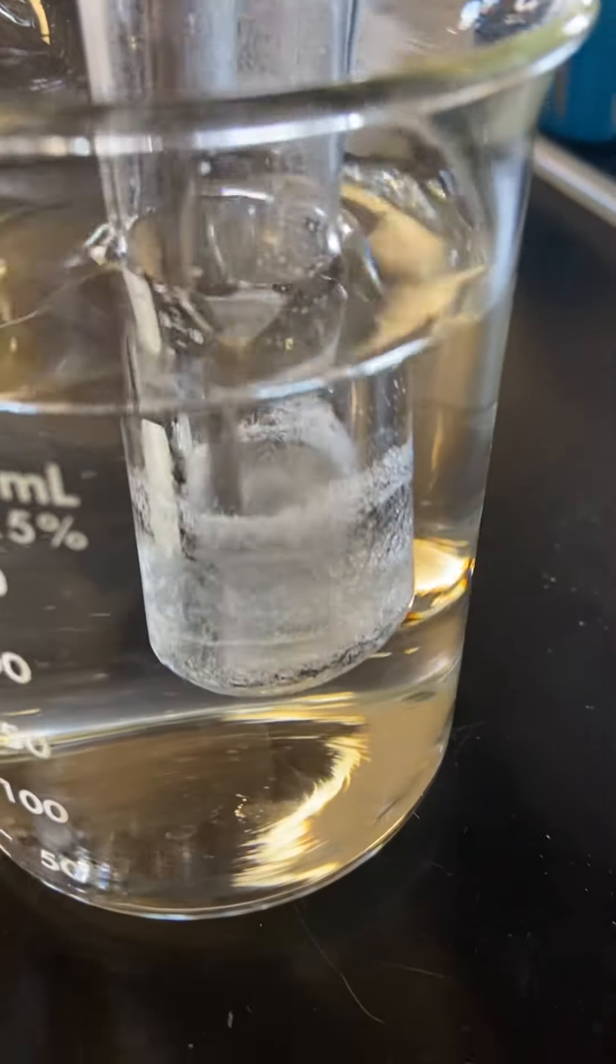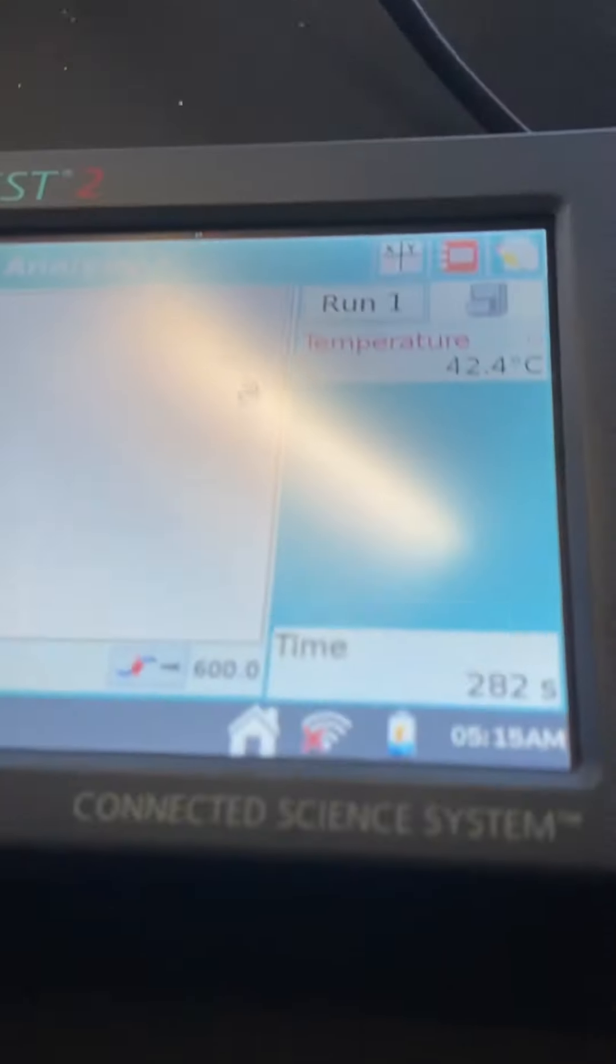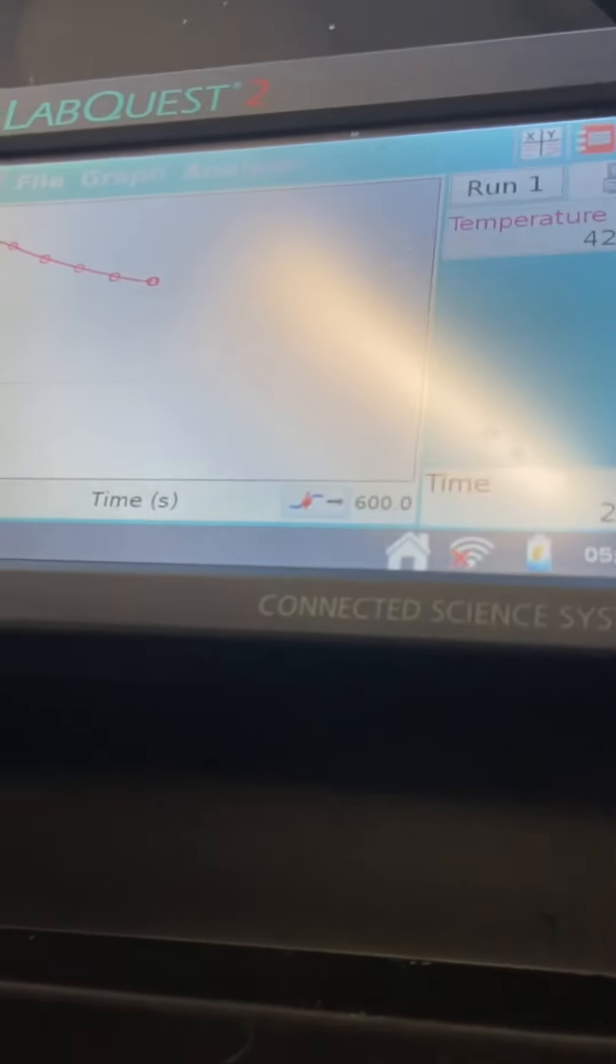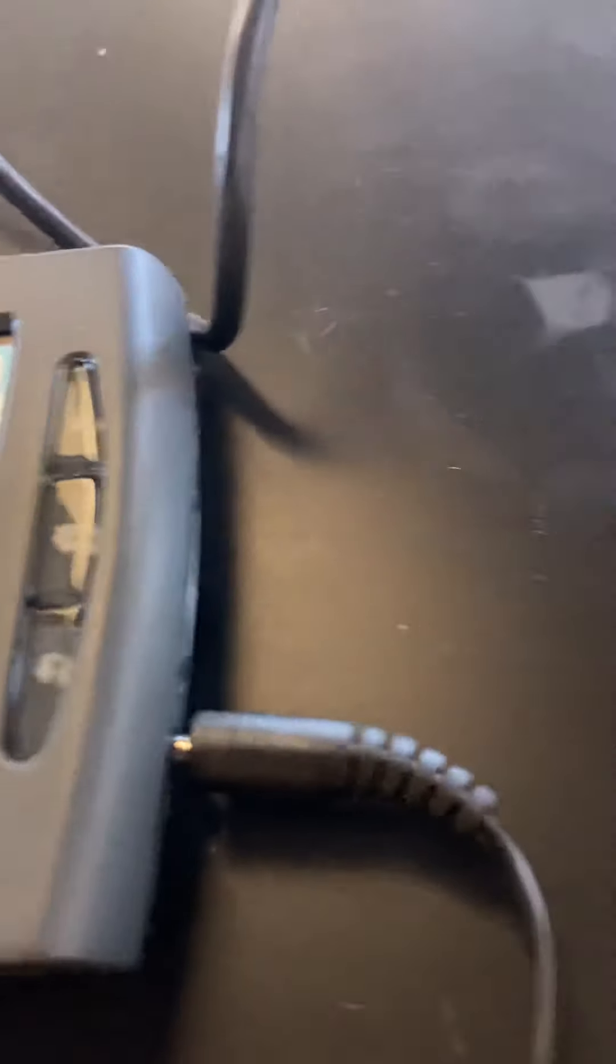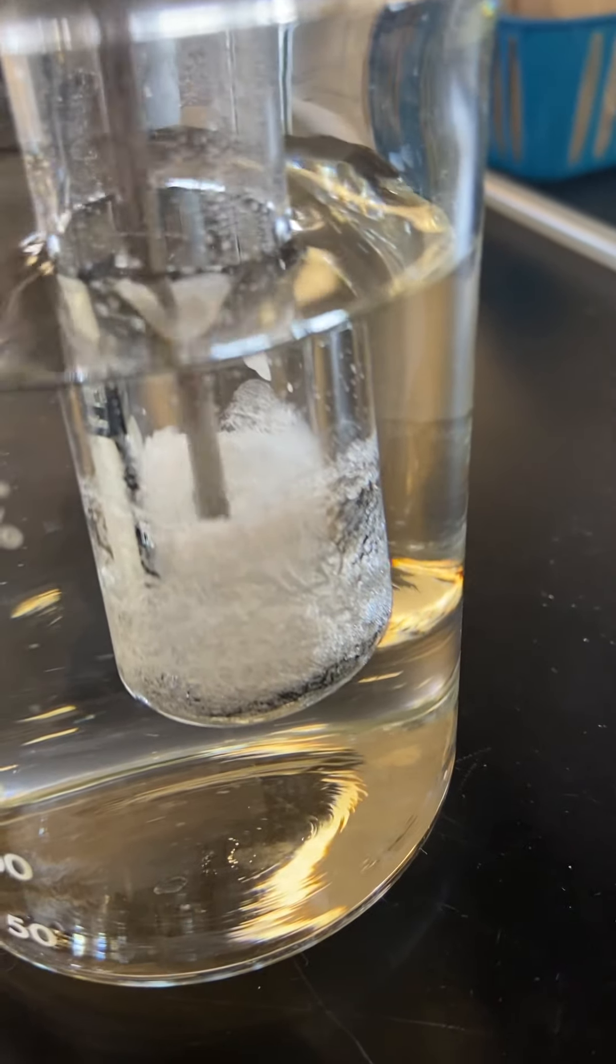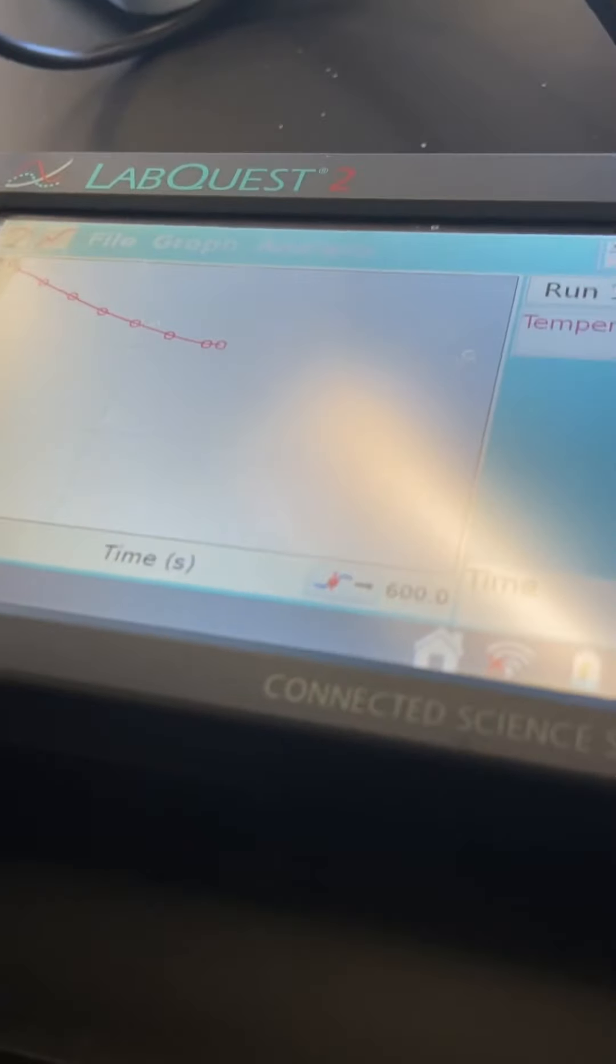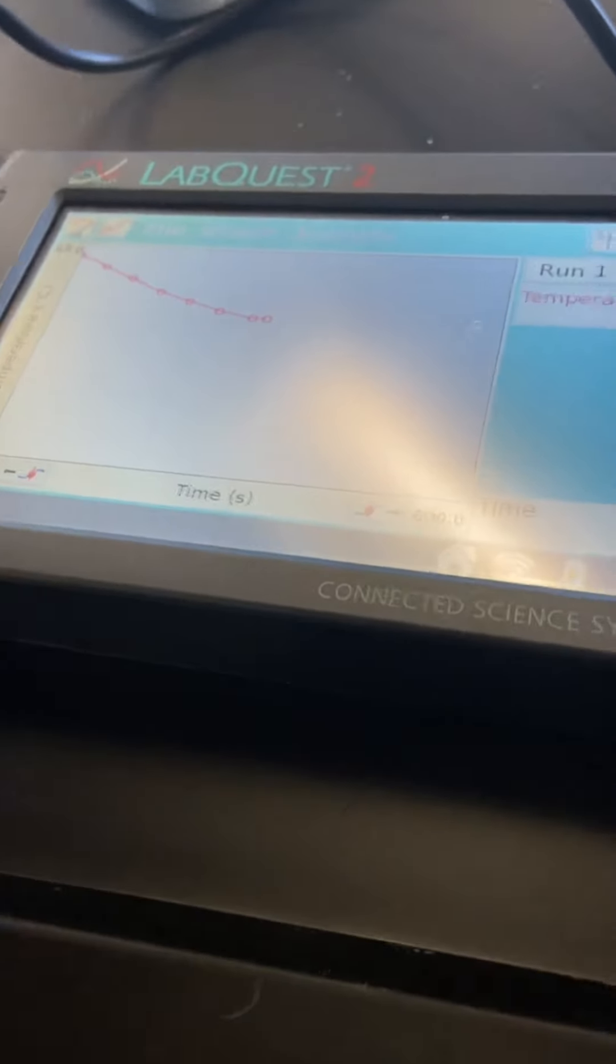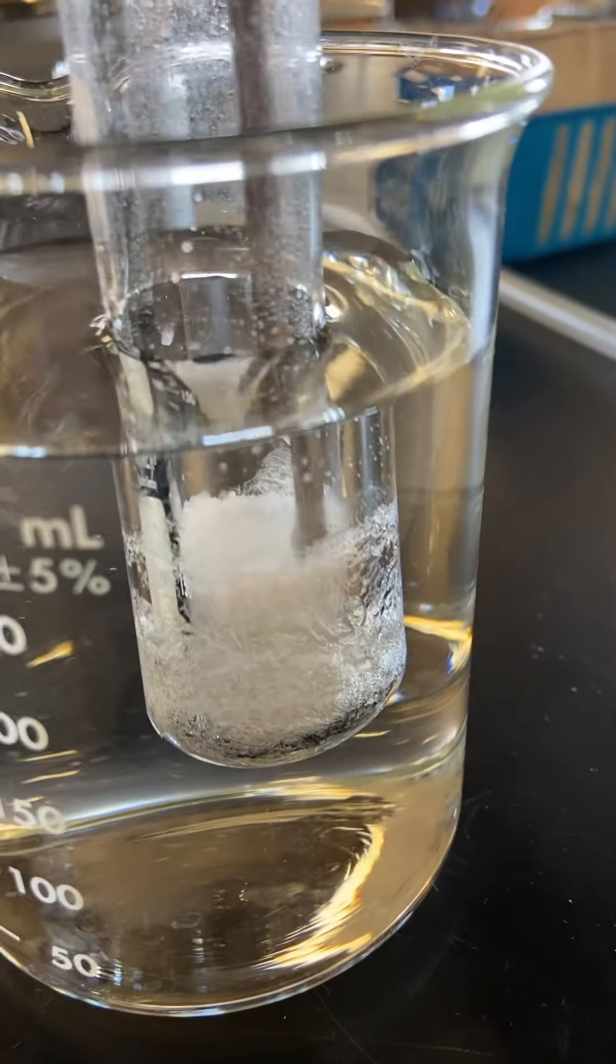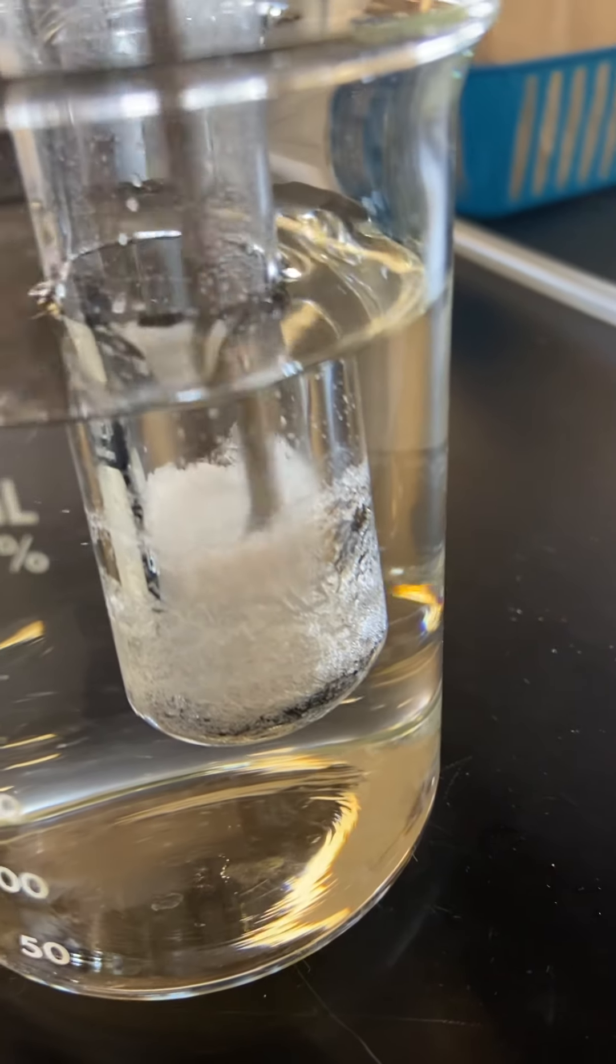Keep stirring. Oh, that is so cool. Nice freezing curve. Continue stirring until the temperature drops below 30 degrees Celsius. A little bit of an exercise in patience.